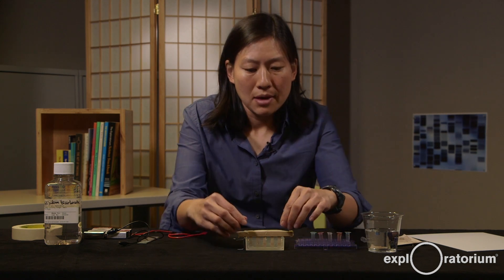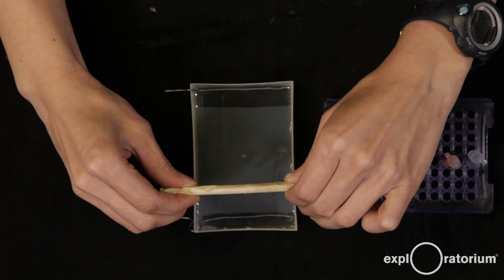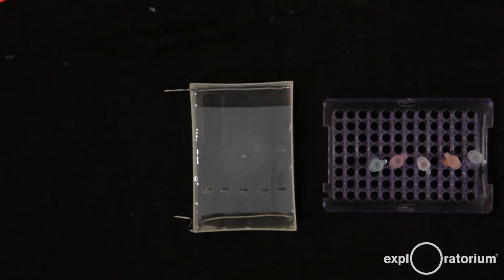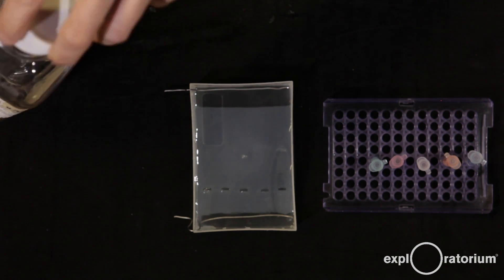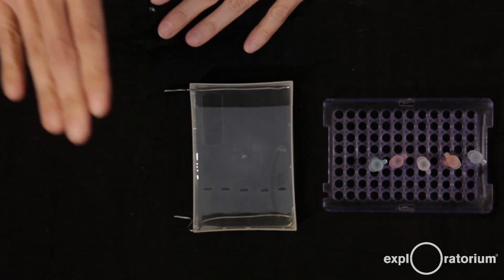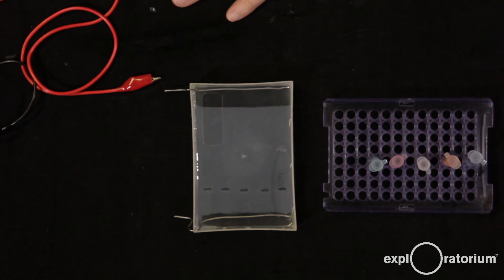Now gently remove your comb by pinching both ends and pulling straight up. You can see the five wells left behind by the five teeth. If you didn't add quite enough buffer and a well is sticking up, add a little more until everything is covered. Now I have my gel ready to be loaded and my power supply ready to be attached — I just need to run some samples.